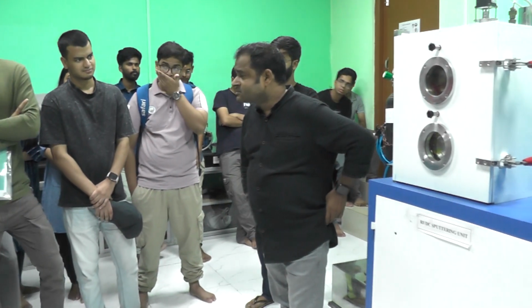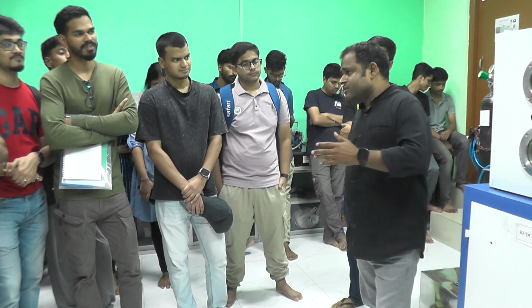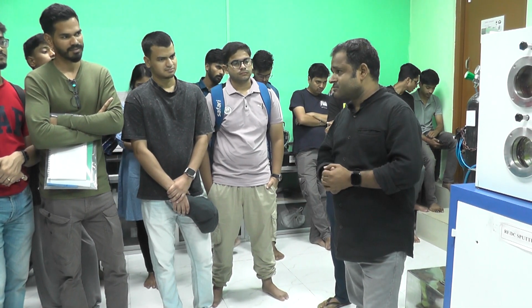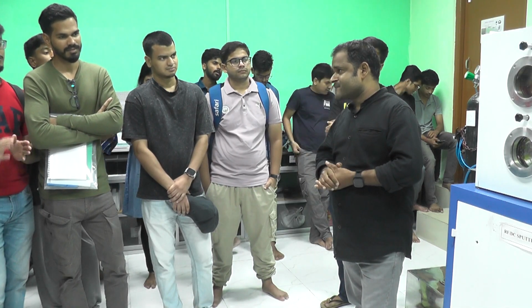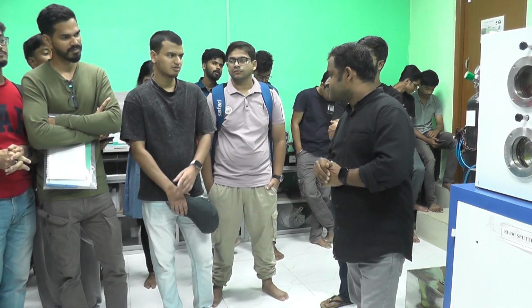two substrates, two targets, because we are going to deposit our superlattice structure, and a superlattice needs two layers at a time, one upon another, 1:1.